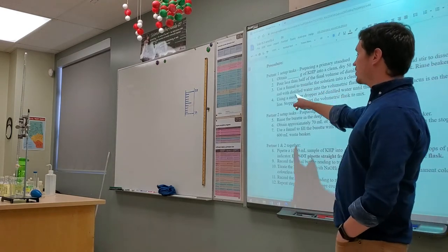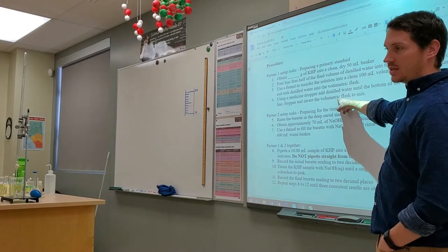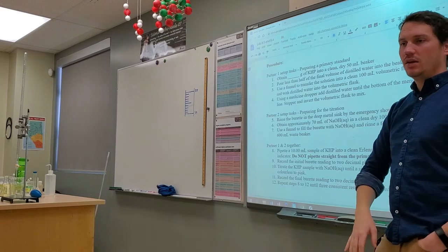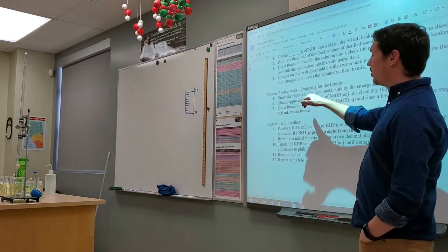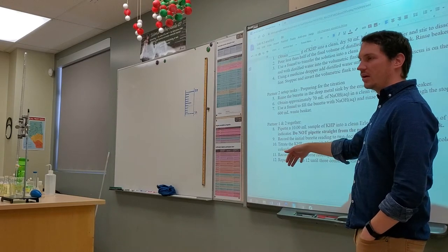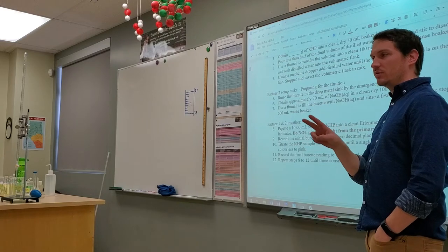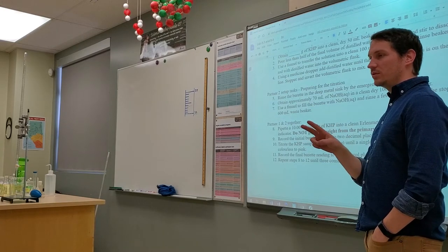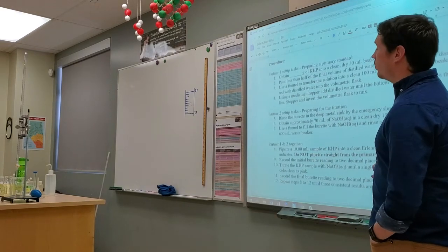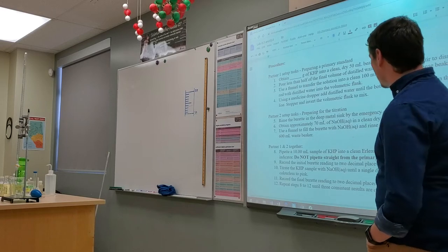We made our solution in our volumetric flask class yesterday. So partner one's steps, you don't have to do that. You're going to start from partner two setup tasks, and then you're going to do partner one and two all together, okay? Remember, this lab was built for 2 days, but are we doing it over 2 days? No, we're doing it over 3 days: yesterday, today, and tomorrow, okay? So we had to split that up, and we'll reformat it next time, whatever, that's not going to affect you.